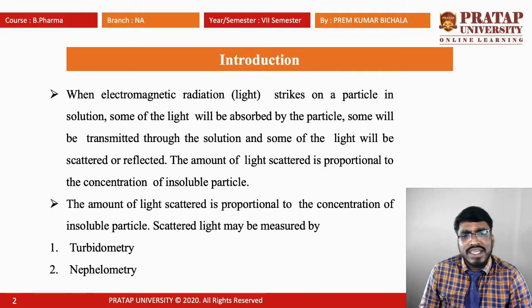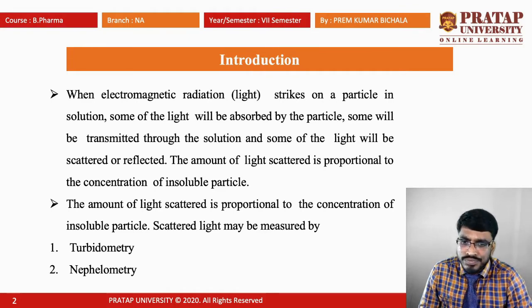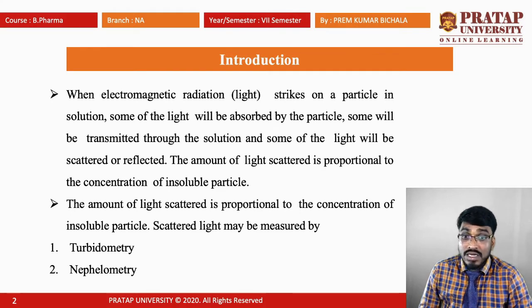The amount of light scattered is proportional to the concentration of insoluble particles. The scattered light may be measured by turbidimetry and nephelometry.